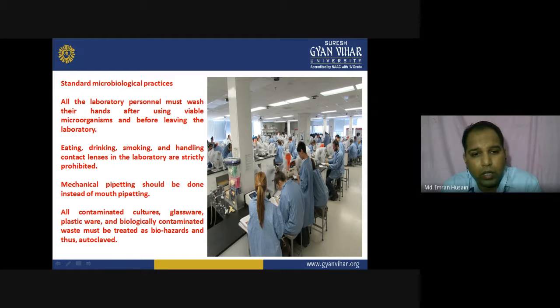All contaminated cultures, glassware, plasticware, and biologically contaminated waste must be treated as biohazard and thus autoclaved. So it is a very healthy practice: whenever you have completed your experimentation process, you are most likely to know this.